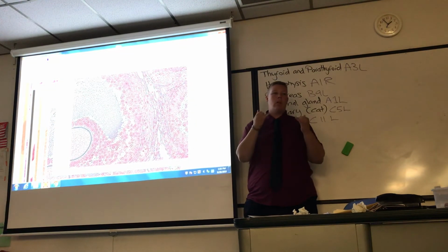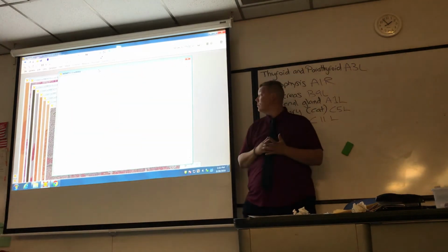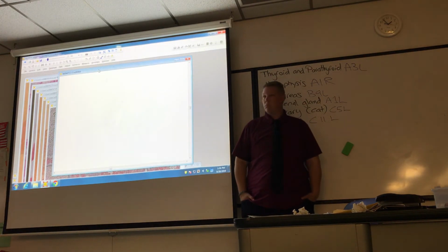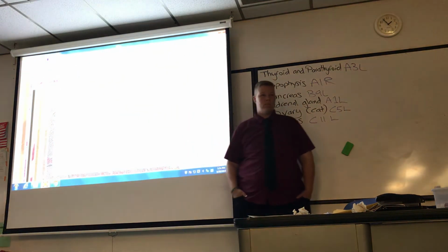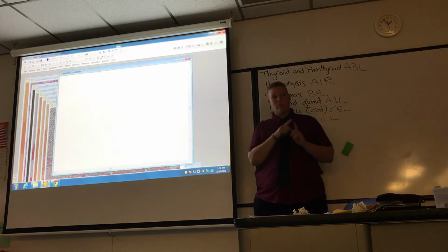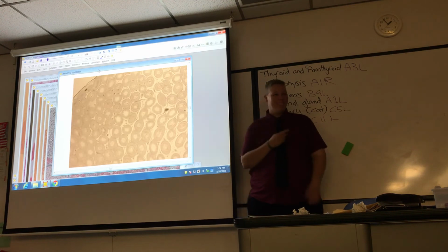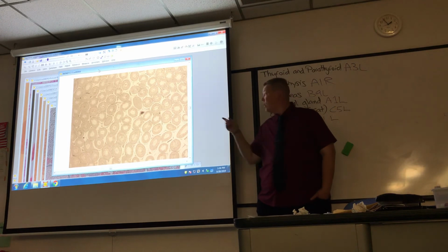Testes. So we're looking at here a bunch of cut tubes, and you can kind of see some things in the middle.